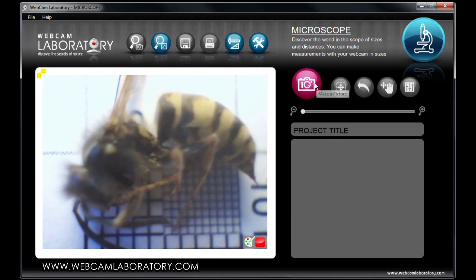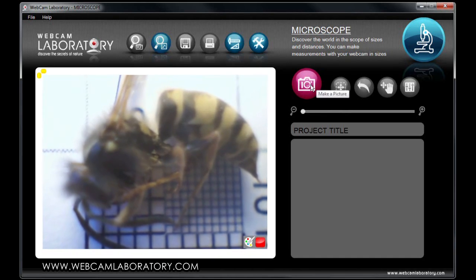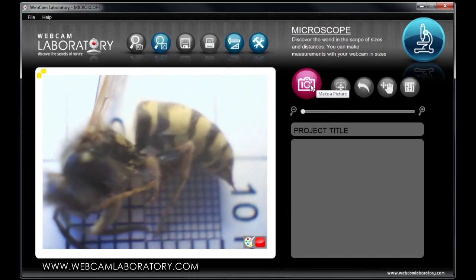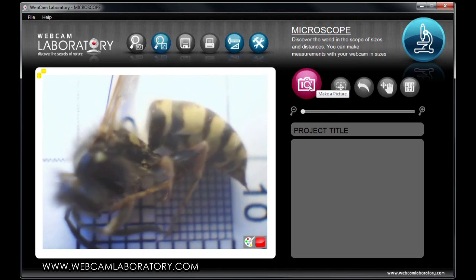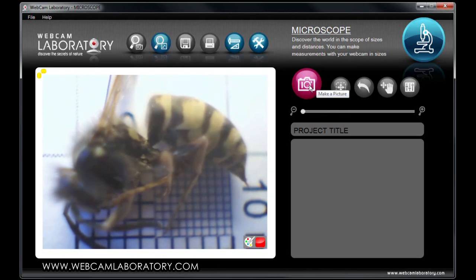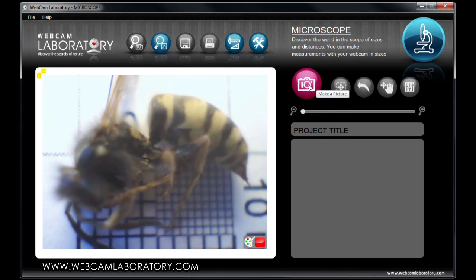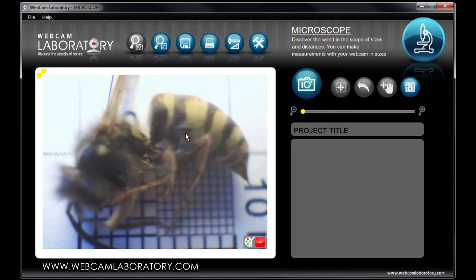Press the Make a Picture button and Webcam Laboratory will take a picture of the object. Once the picture is taken, you can set the webcam on your desk so you can concentrate on the experiment.